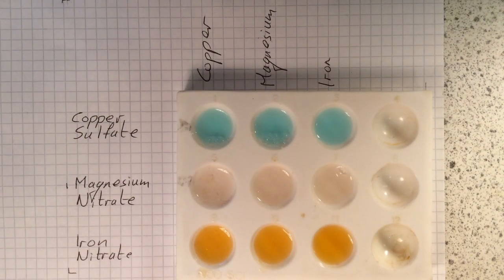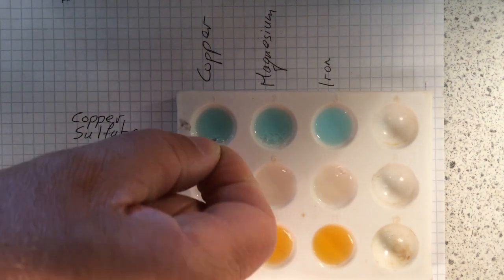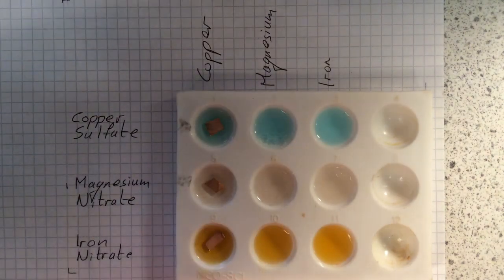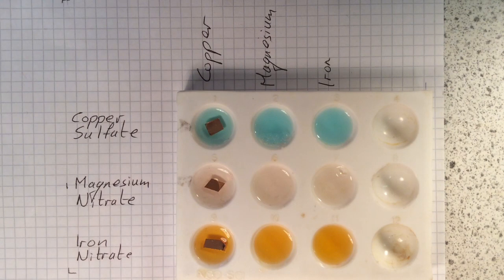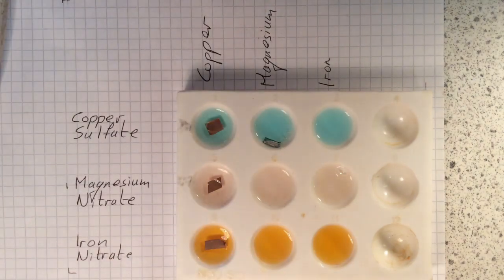And then what I'm going to do is put some of the bare metal in there. So this says copper, so there's a piece of copper I'm just dropping in there, and another piece of copper goes in the magnesium nitrate, a piece of copper goes in the iron nitrate, and then we have 3 pieces of magnesium. Now magnesium goes in the copper sulfate, and we saw that earlier in the test tube.